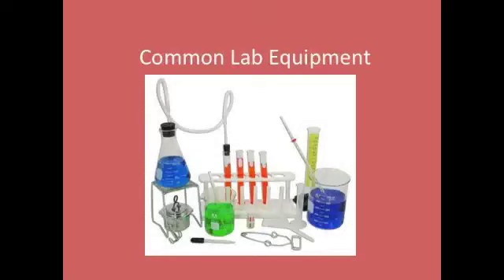This video goes over some common laboratory equipment and their uses for a chemistry classroom. Not all the equipment that you will be using during the year is listed on this, just the ones you're going to use over and over again. Anything that's not here, I'll explain the use for them when we use them.